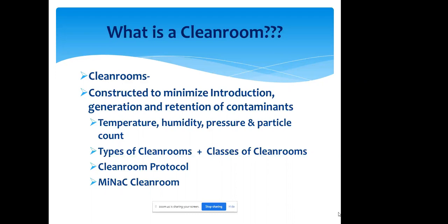So clean rooms are constructed to minimize the introduction, generation, and retention of contaminants. And your contaminants can be anything from temperature, humidity, pressure, particle count, electrostatic discharge, and all those things.